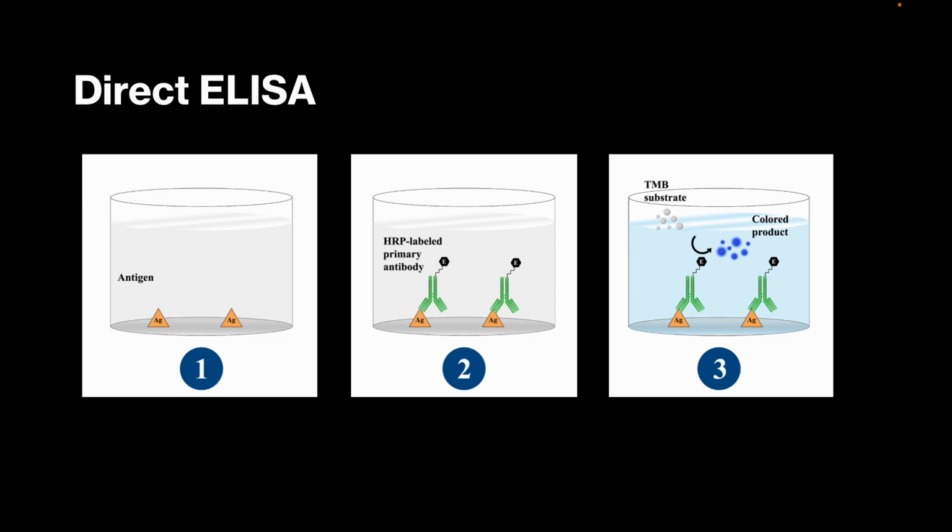But the problem here is, so the advantage is it's very simple. You don't need so many reactions. It's less time consuming. But then there are disadvantages. First thing is it's very expensive, because you need all the primary antibodies linked to an enzyme.